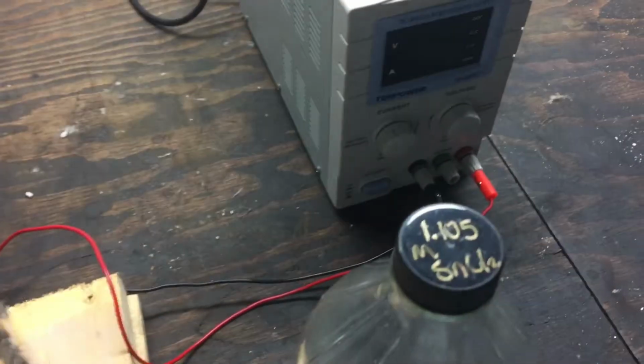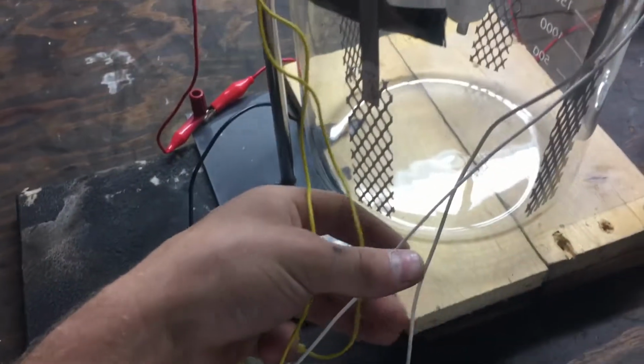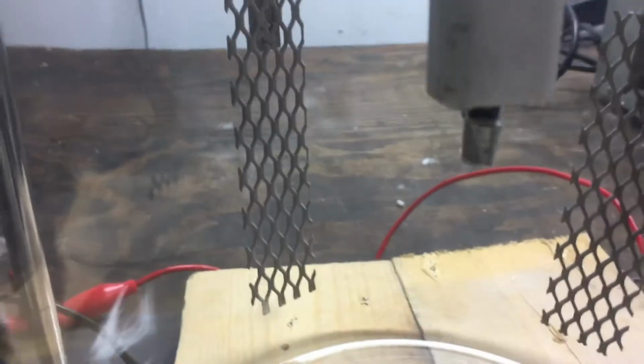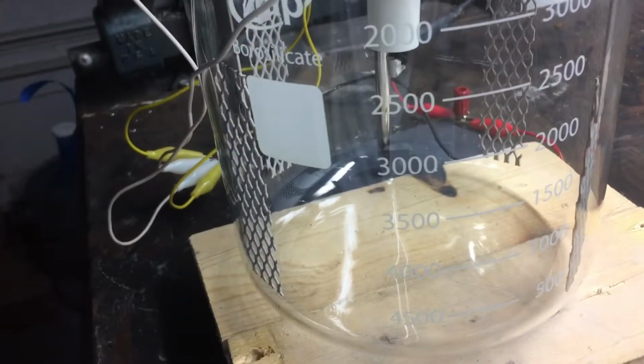So coming from the power supply are my anode and cathode wires, which come to here. The anode comes and attaches into 4 separate wires, which are attached to 4 separate platinized titanium anodes, and in the center, through a piece of PVC pipe, which is wired up over here, you can see that there's a small cylindrical piece of tin which I furled into a round shape. Add this solution, although I'm going to probably use about half of it and dilute it, and I'm hoping to get to around 2,500 milliliters, so it's going to be fairly dilute.